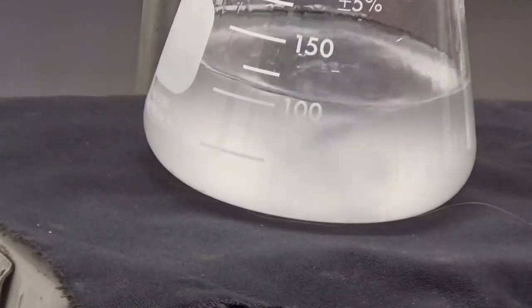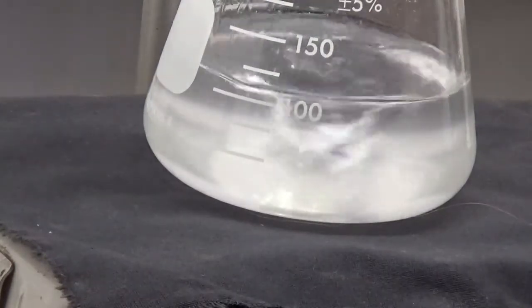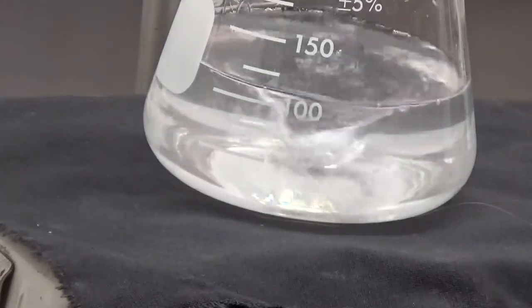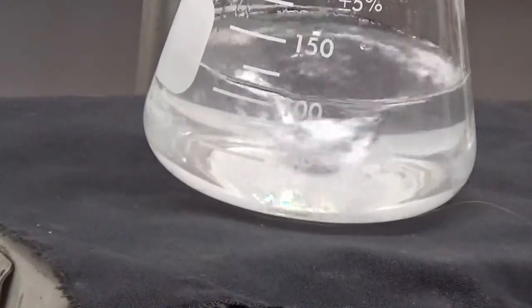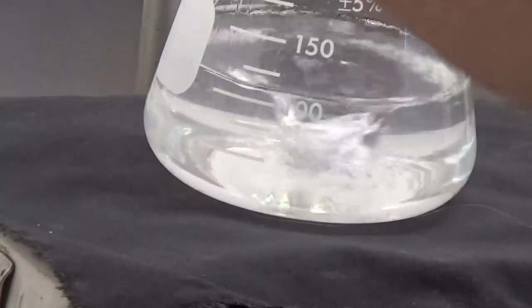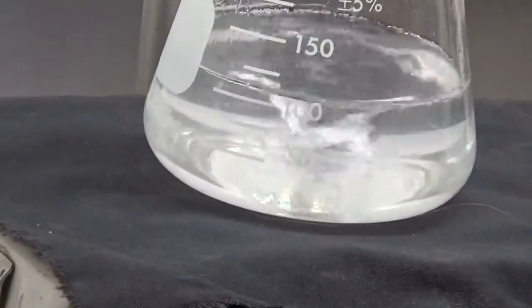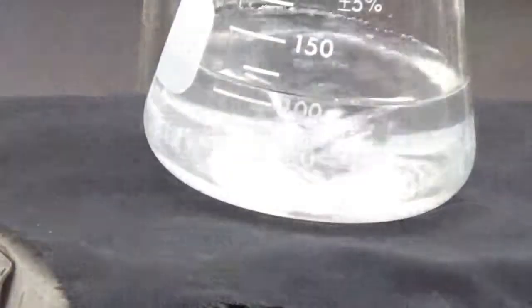What is actually going to happen? I think I did it. It's right there. I might have added a few too many drops there though. 12.40.